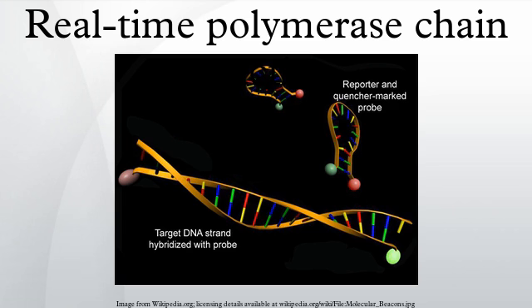The MIQE guidelines propose that the abbreviation qPCR be used for quantitative real-time PCR and that RT-qPCR be used for reverse transcription qPCR. The acronym RT-PCR commonly denotes reverse transcription polymerase chain reaction and not real-time PCR, but not all authors adhere to this convention.